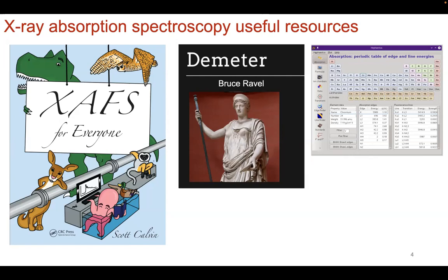So if you ever need to process data, this is a very useful package, although it's not the only package out there. I highly recommend it. Although it's the front end to FEFF, which is really the software that processes all the X-ray absorption and interaction for the graphical user interface. Okay.